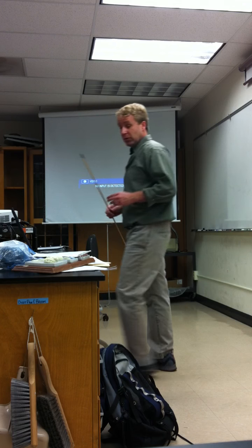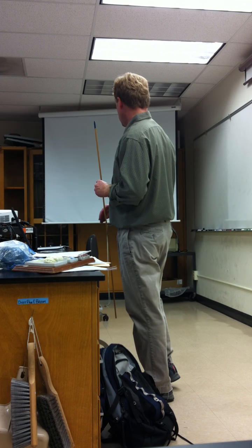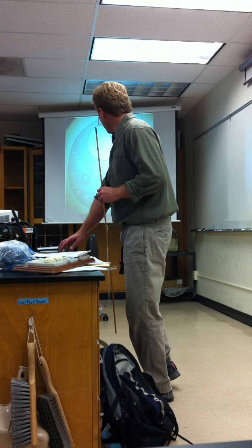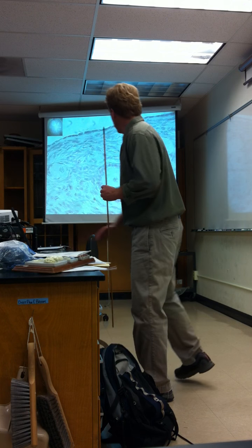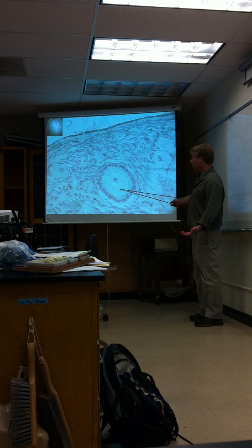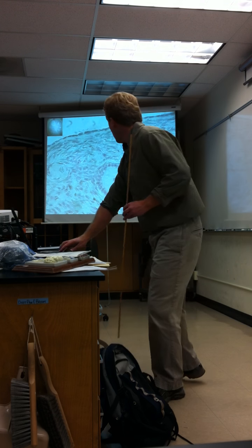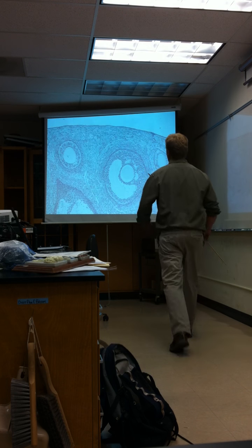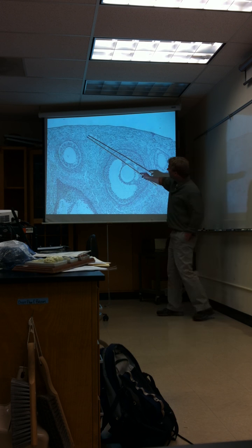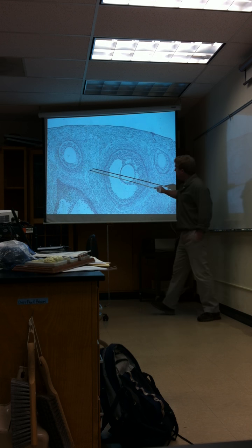And let me show you just very close. Now I'll just go to the PDF pictures, which is very similar. And so you can see we zoom in right there. That's exactly where we were with this ovary. And so we zoomed in right there, and we can see the primordial follicle. There's a good primary follicle, another primordial follicle, germinal epithelium. If we move over just a little bit on the same slide, I can see this. And we'll just go over these ones. And so you can see these are these primordial follicles. And then we'll compare this one to this one.